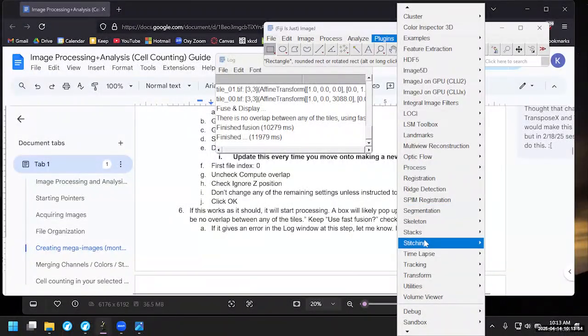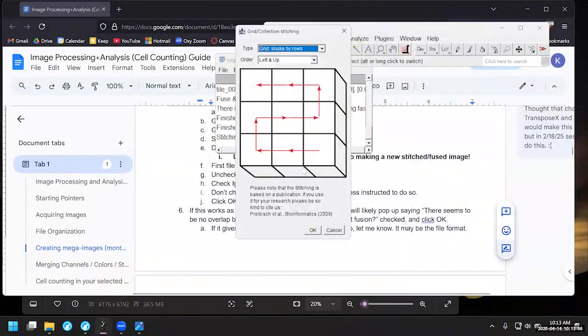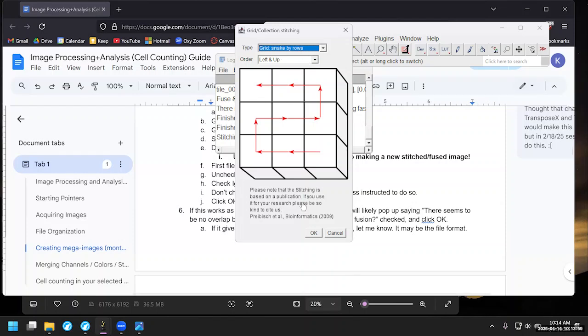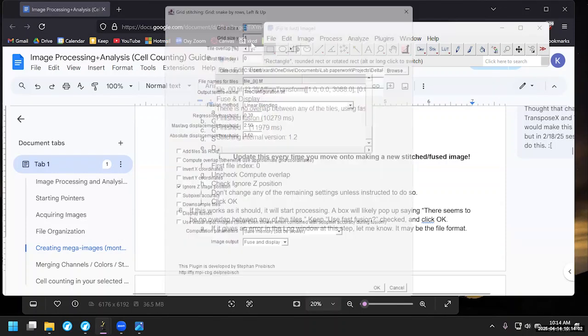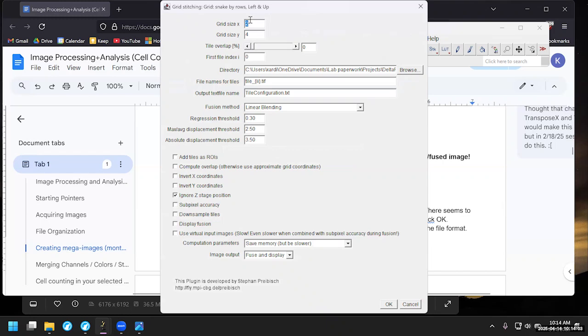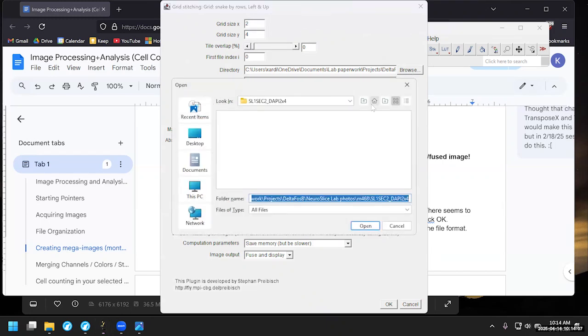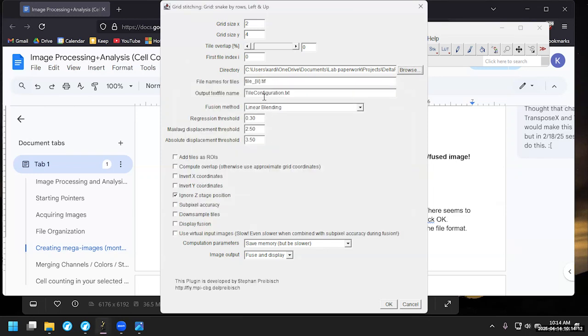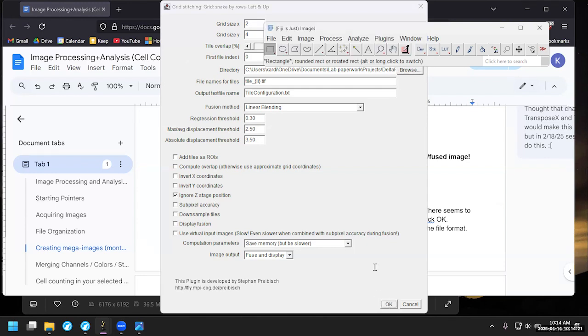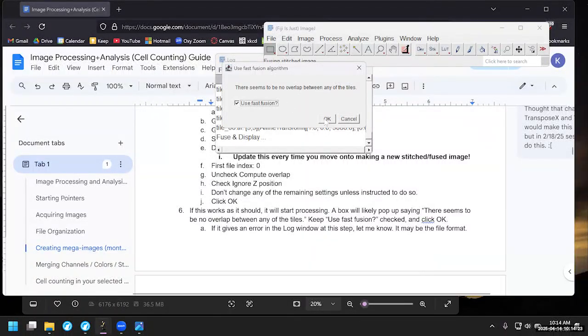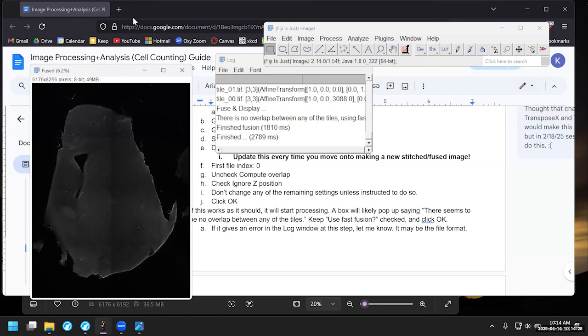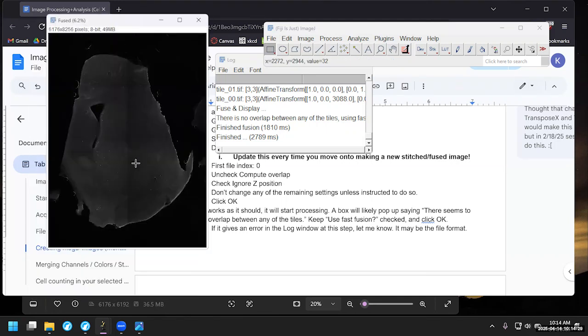So now it's saved it. We're going to go ahead and just close this because we don't need it right now. Plugins, Stitching, Grid Collection, Stitching, snake by rows, left and up. Hit okay. It kept some defaults from earlier, so that makes our lives simpler. We do want to go to a new directory because it's still pointing at the DAPI one instead of the DFB that I just started using. We will keep everything else the same. We don't have to change these checkboxes. They'll only reset after we close ImageJ. So we get to hit okay. Crank that out. Fast fusion. Okay.